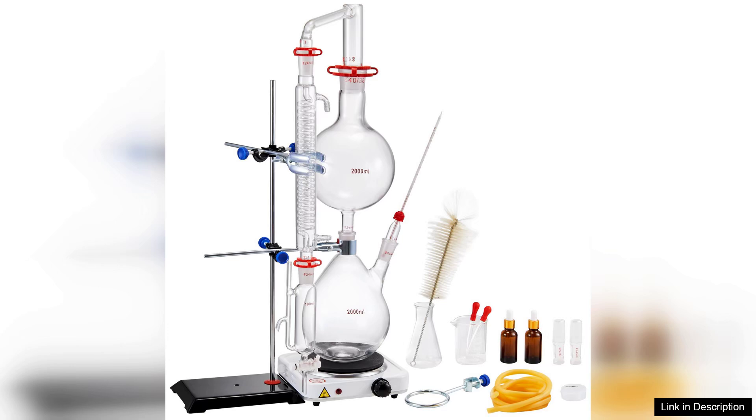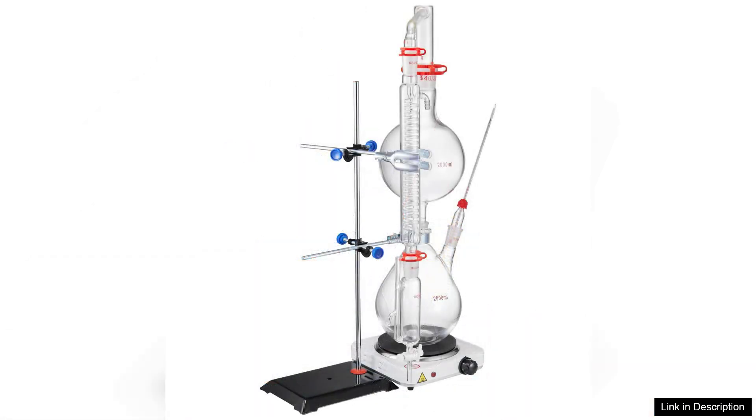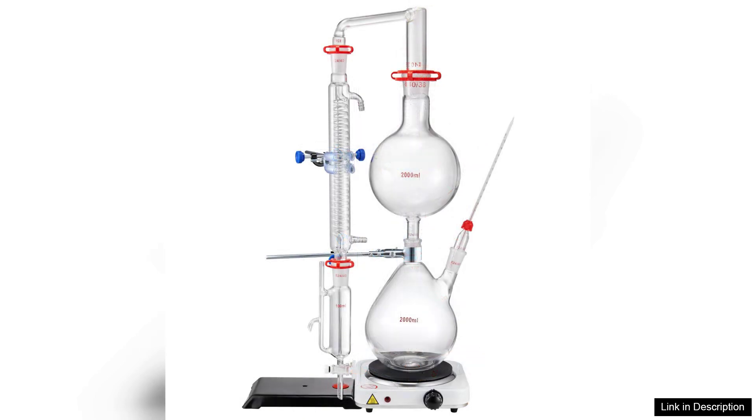Additionally, the design of the apparatus is user-friendly. The connectors fit snugly, preventing any leaks during operation. I've used other distillation kits in the past, but none have provided the level of performance and reliability as the VEVA kit.